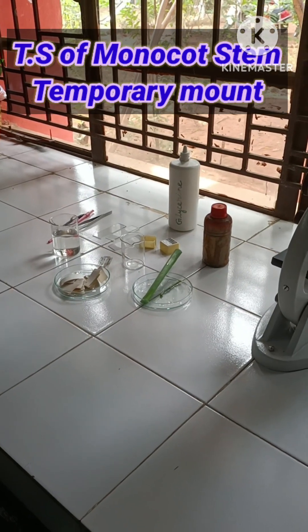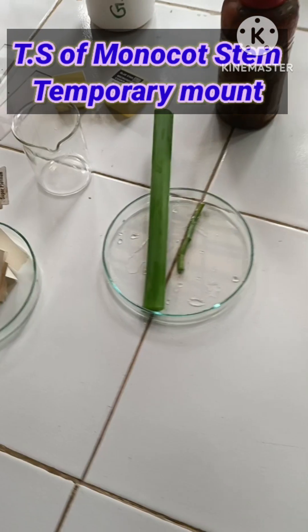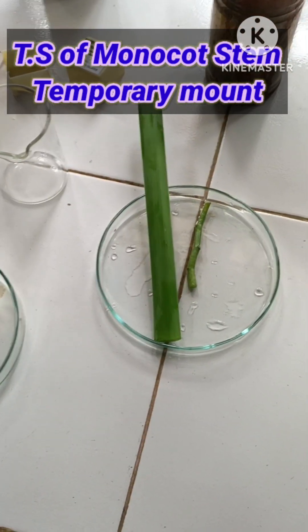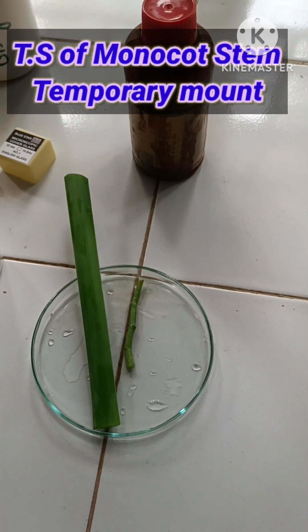Hello children, welcome to today's biology class. So today we are going to take the TS of stem — that is monocot. This is monocot stem, this is dicot stem. Both are fresh stems I have taken.